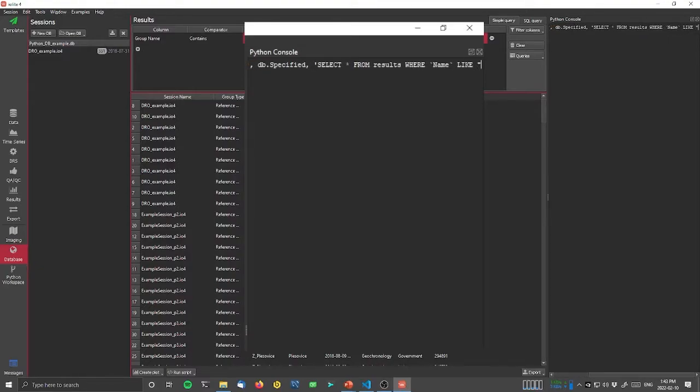and here we have to be a little bit careful about what quotation marks we use. If we use a single quotation mark, you can see that it will finish off, it'll close out this string that we've started making. So we need to use a different quotation mark. In this case, we'll use double quotation marks because we've used a single at the start here.